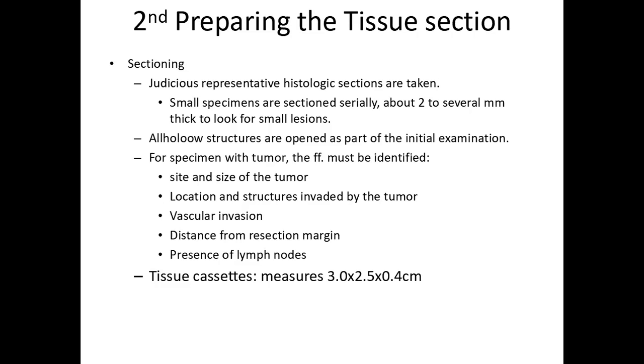No? And in choosing the representative sample, we must choose the most abnormal part. No? Yung pinaka-abnormal ang kukunin natin. Kasi ina-assume natin na doon sa abnormal part na yon, nandoon ang disease. No? Nandoon yung abnormality. Okay?